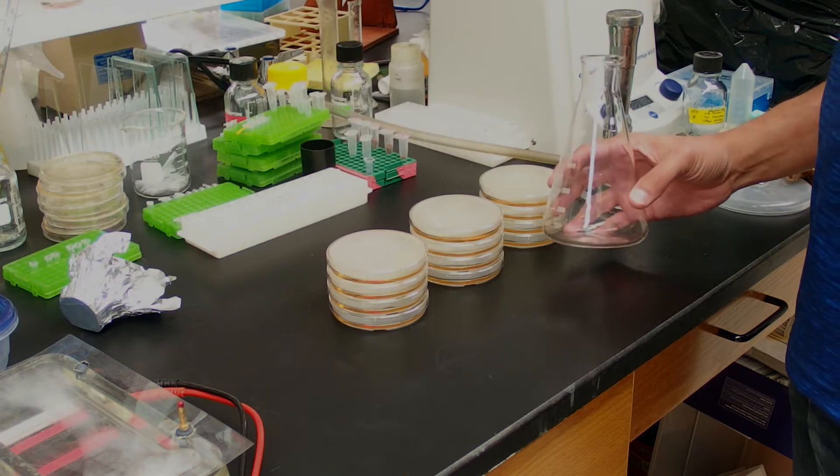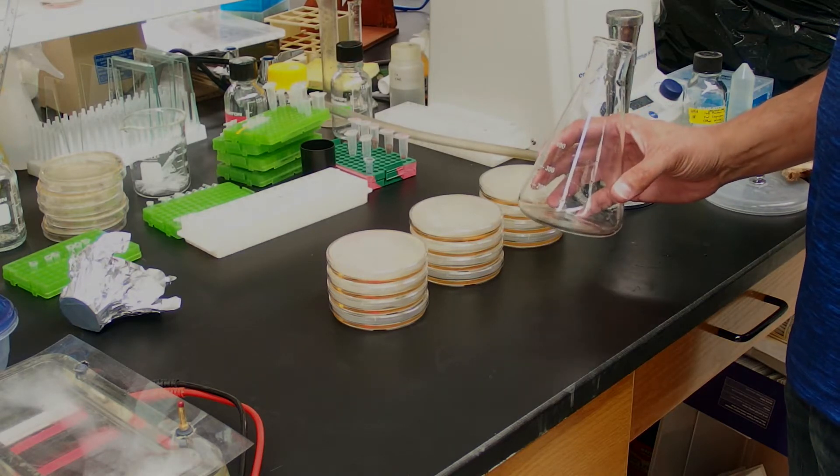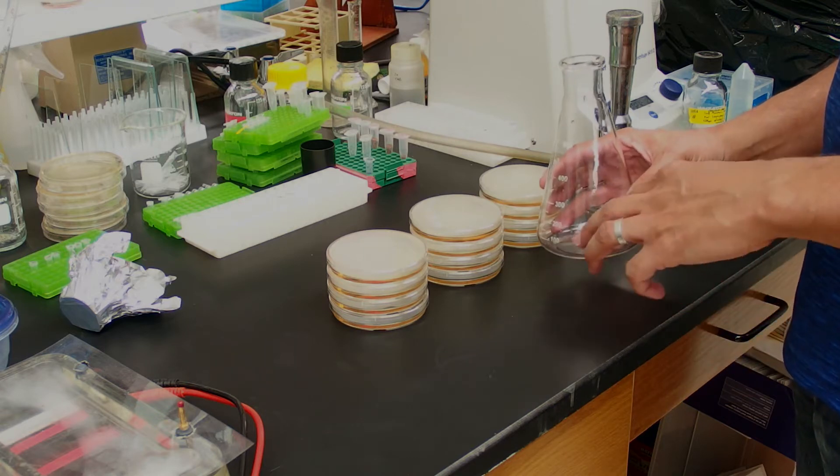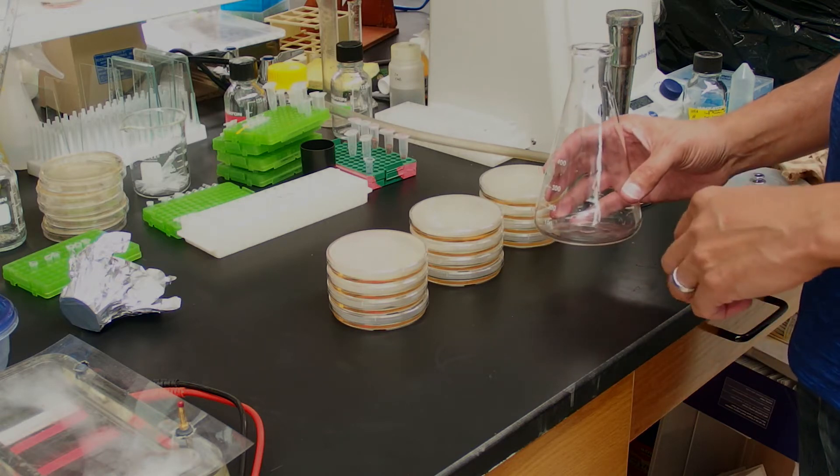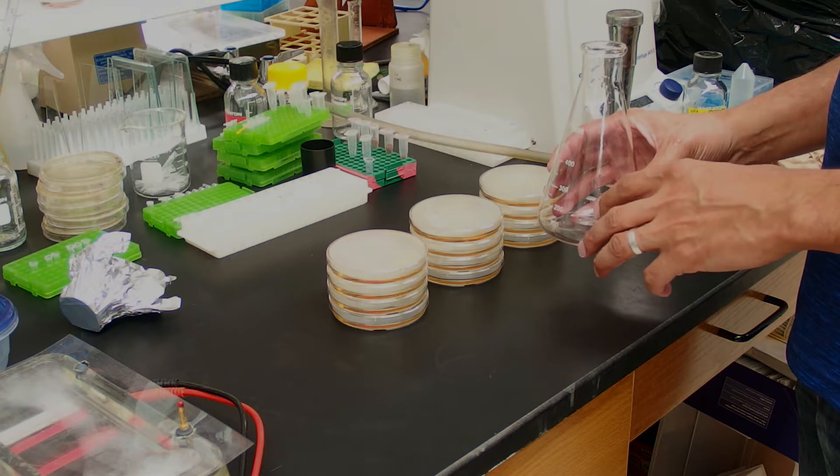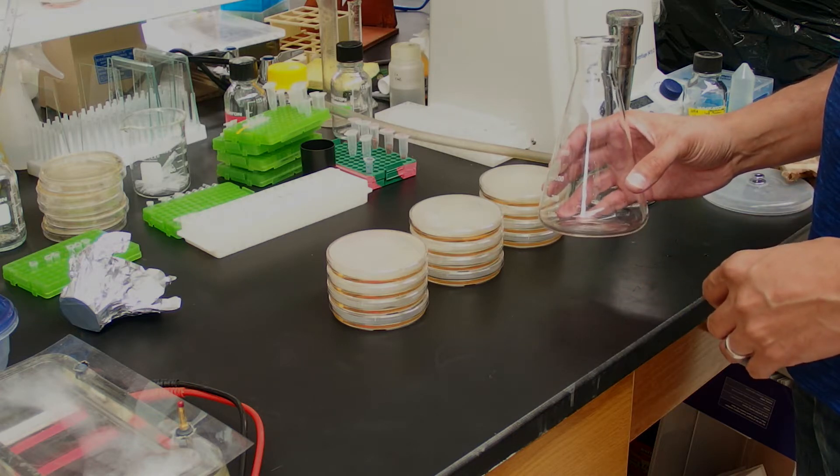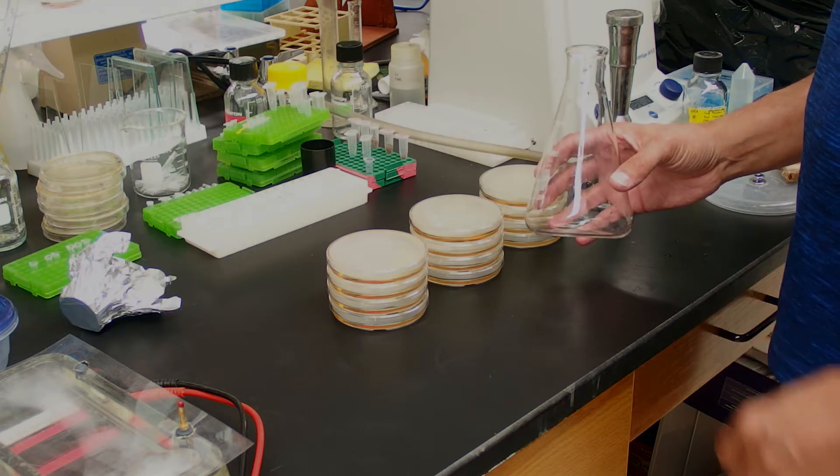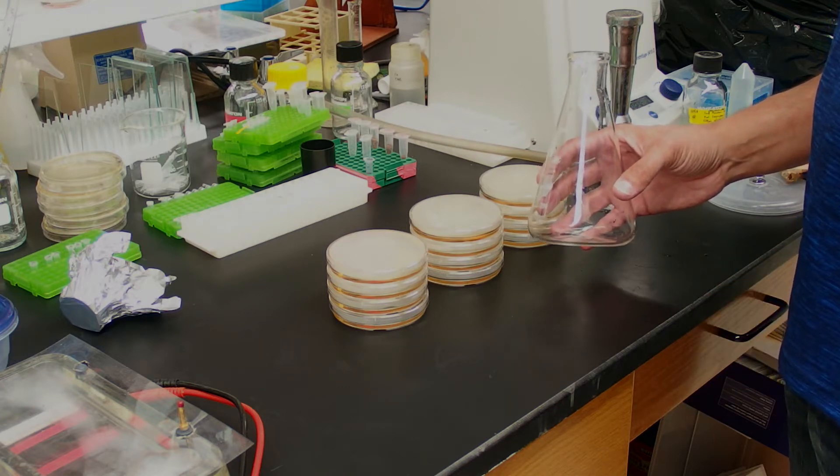One thing we need to do is we need to clean out our Erlenmeyer flask right away after we pour our plates. We don't want agar to gel too hard inside of here. Once the agar is gelled and dry, it can be hard to clean out this flask. So the best thing to do is to immediately rinse this thing out with some hot water and the cleaning will be easy.